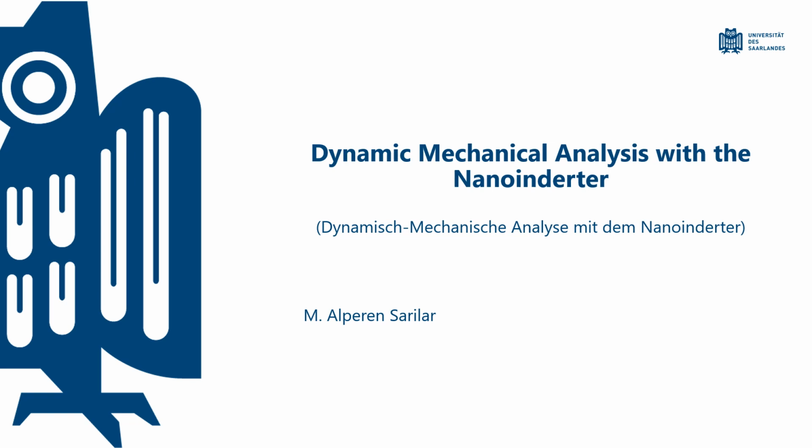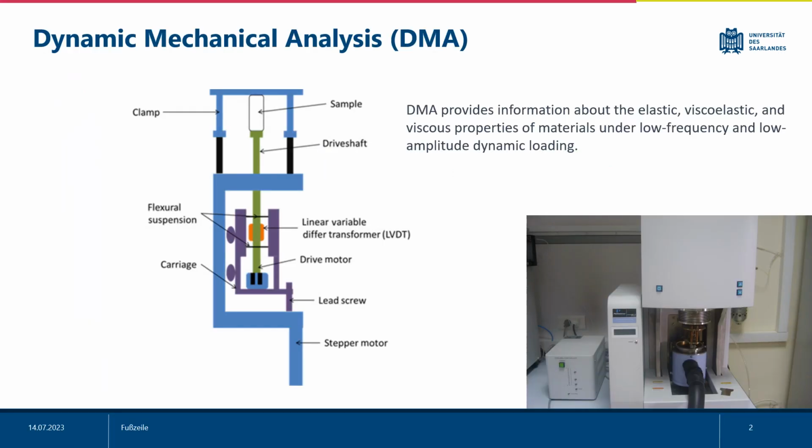Hello, I am Alperen and today I will make a short video presentation on the subject of dynamic mechanical analysis with nanoindenter. To make a brief explanation, when a load is applied to a material, it deforms.